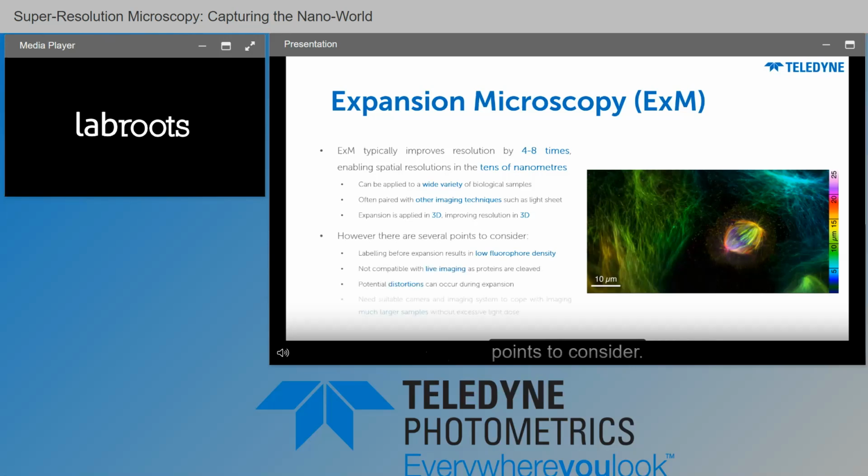However, there are several points to consider. If you label your sample with fluorophores before the expansion and it spreads out, they're now much further apart and you have a low fluorophore density, so you may struggle for signal. You may need to label after you expand your sample.